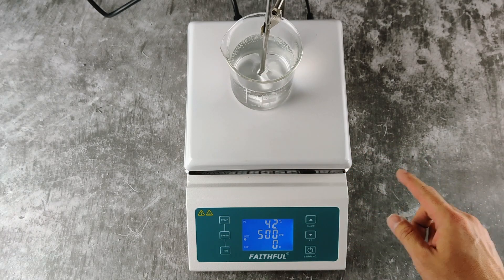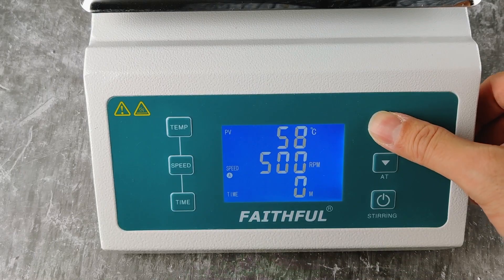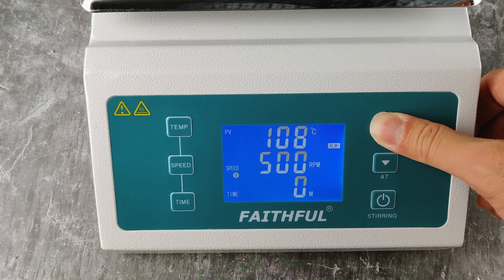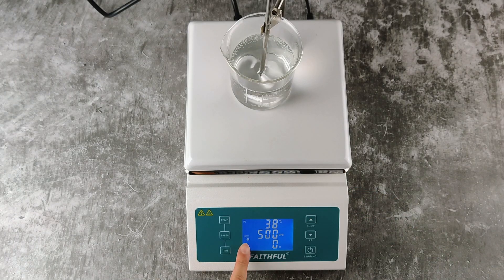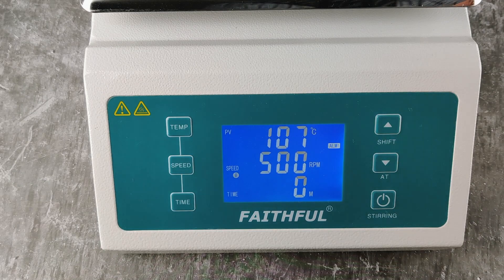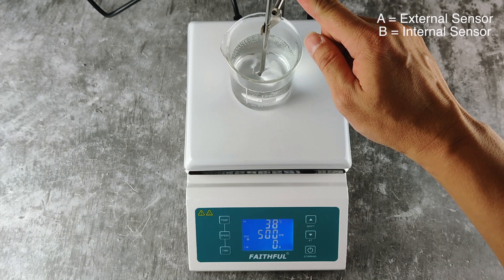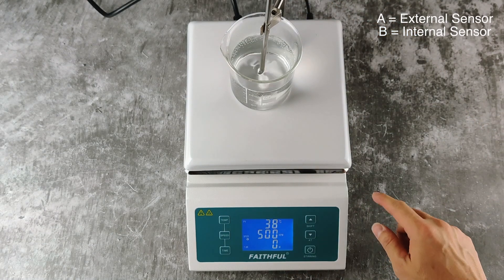To swap these sensors, you hold the shift button for 3 seconds. You can see it has changed from A to B here. So again, A is for the external sensor and B is the internal sensor.